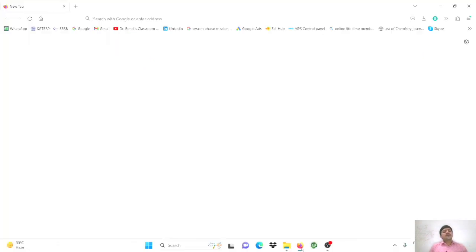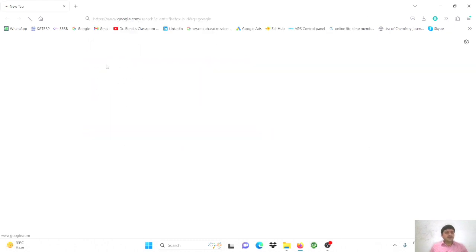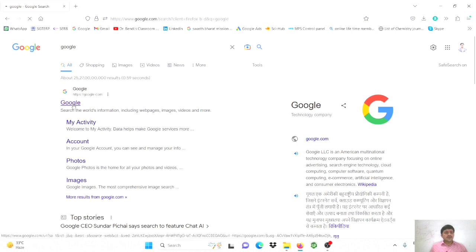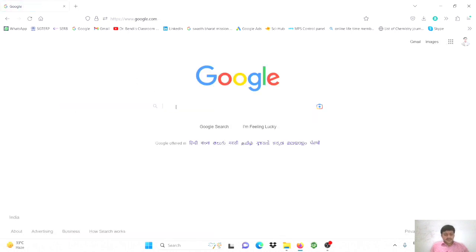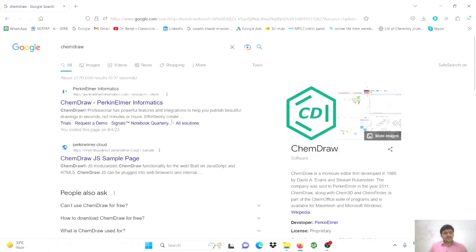Before starting the basic tools which are available in CHEMDRAW, let's discuss how to install the CHEMDRAW software in the laptop or the computer. For that purpose, what should you do? Simply you need to open Google. In Google just type CHEMDRAW.